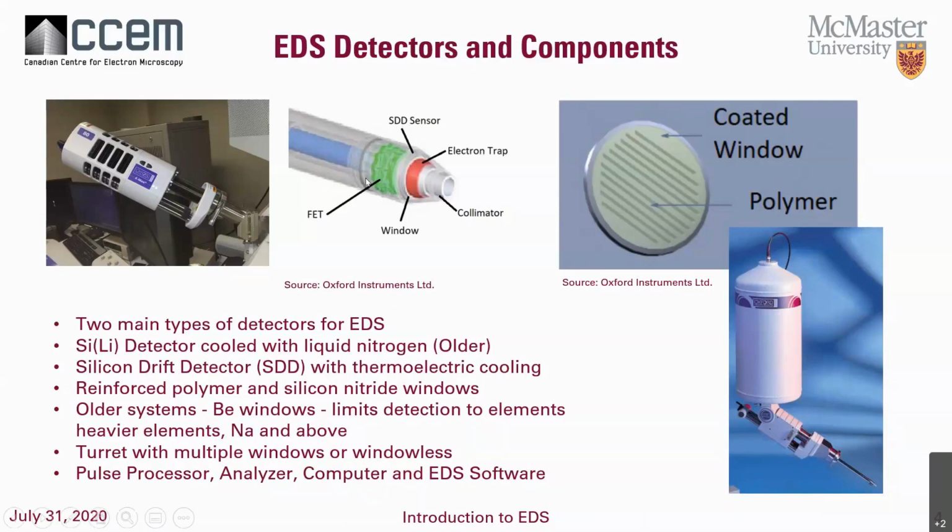And behind that, we have a field effect transistor, which is used for some of the amplification that needs to happen once the signal goes out into our pulse processor and analyzer systems. So we'll have a computer associated with EDS, and we'll have EDS software for doing things.